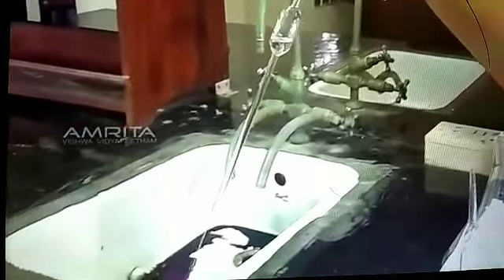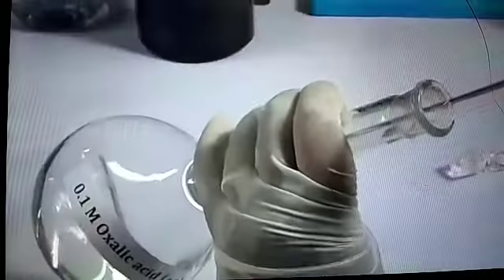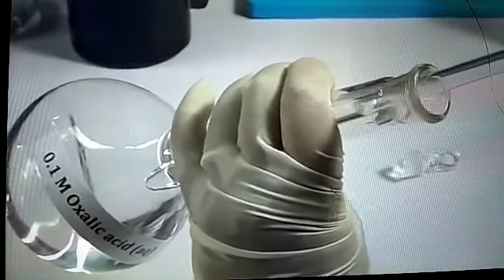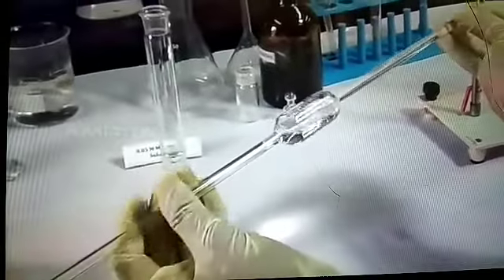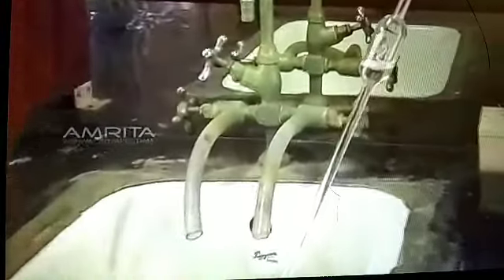Repeat this process 2 or 3 times to remove the impurities from the pipette. After rinsing with water, pipette out a small volume of oxalic acid solution, rinse the pipette and drain it. Repeat this step 2 or 3 times to remove any moisture inside the pipette.